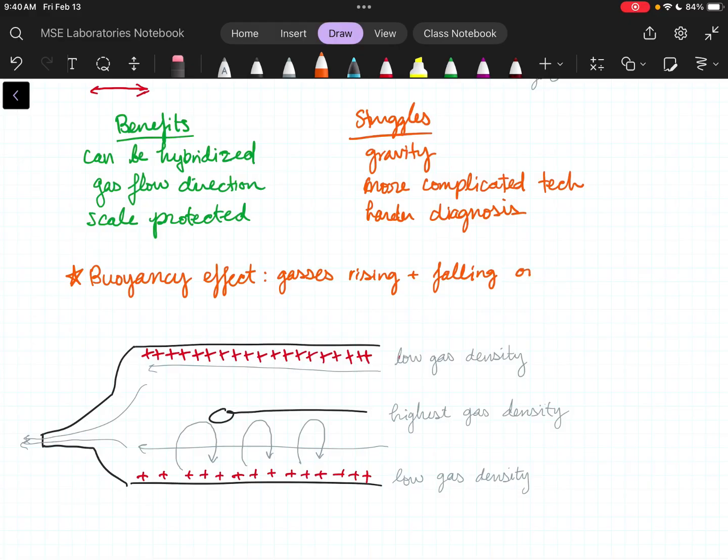But because I have this moving gas, do you know how airplanes work? It creates lift when it's moving. So we have all this moving, bubbly gas going on down here, and our sample is going to appear to lose mass right at the start of our test.